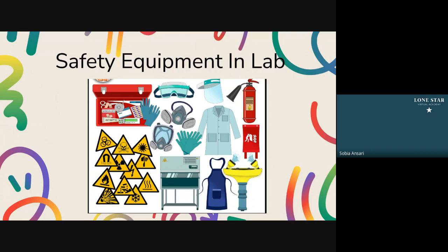This is also why, in lab, you should not be wearing contact lenses. If the chemicals get under the contacts, then the eye wash station will not be able to help you until you take the contacts off, which would be really hard at that time. Generally, you have to rinse for 15 minutes. And this right here is a fume hood. Anytime you're working with heat or fire, you're going to want to do this under a fume hood.